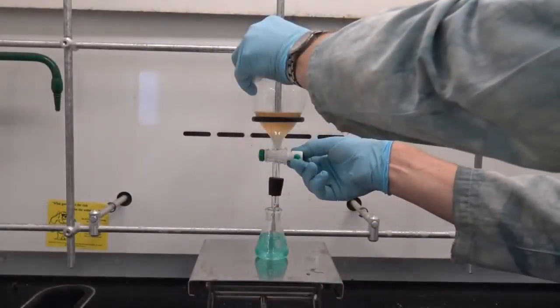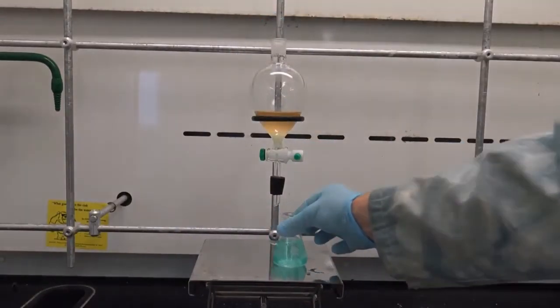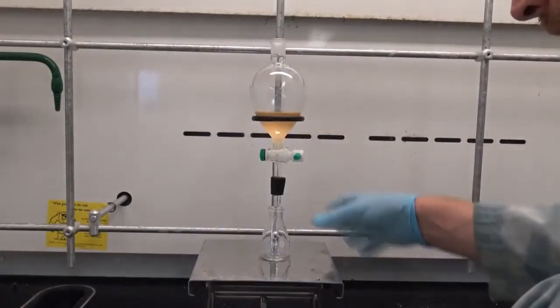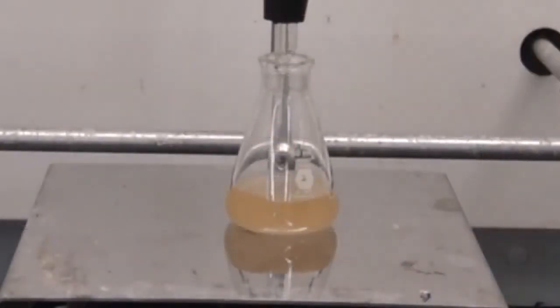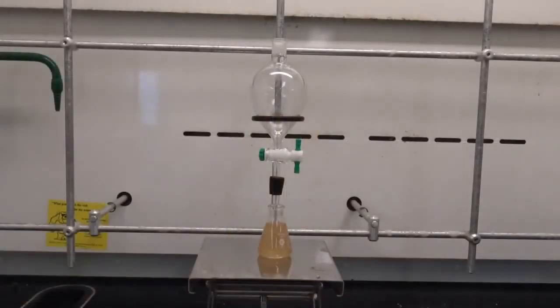There it is. Having stopped the flow there, I now have an aqueous solution of pure blue food dye. And finally, I'll collect my purified naphthol by adding a new clean collection vessel and opening the stopcock, allowing that solution to drain into that new collection flask. Notice again, we've got a yellow solution now. We've gotten rid of that blue impurity that was ultimately causing my product to look green.